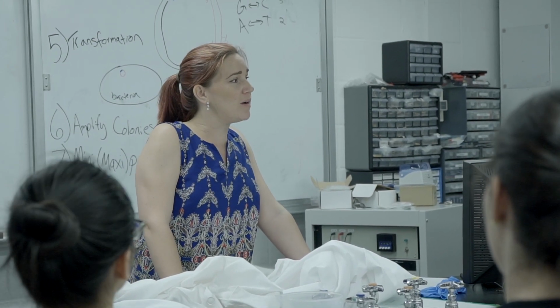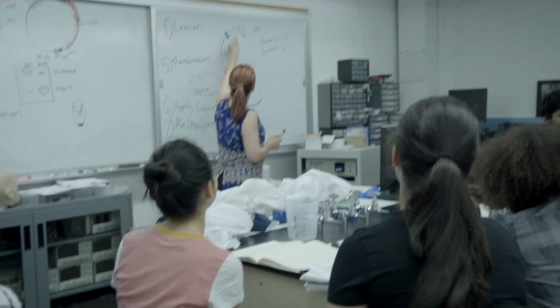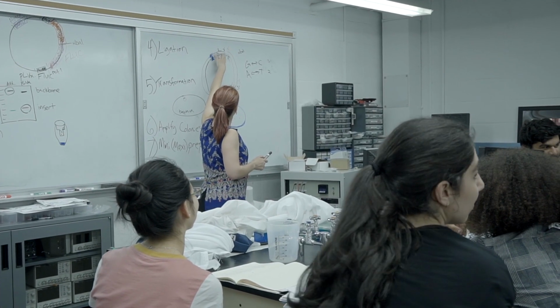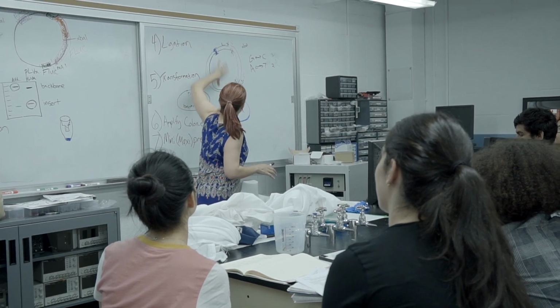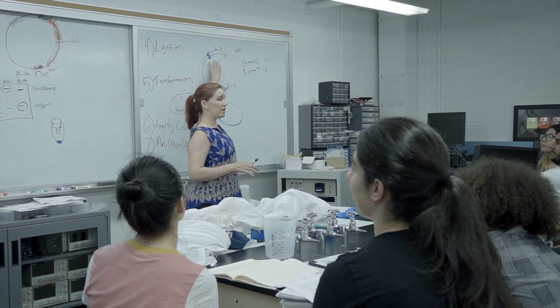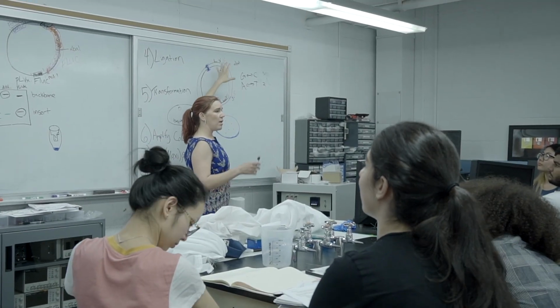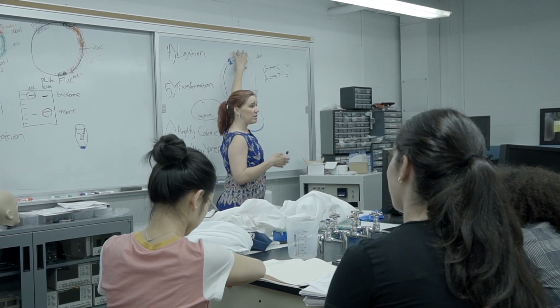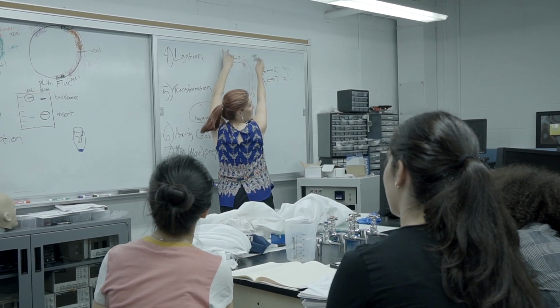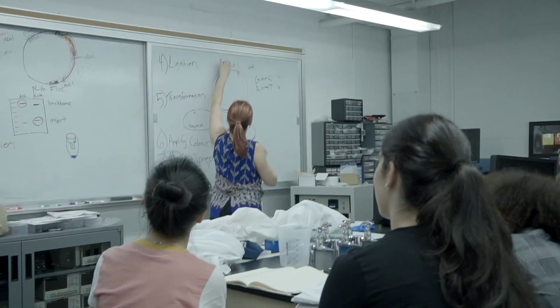Yes? How do the primers work? Oh, great question. In order for your reaction to know, because we are going to copy this whole thing for the PCR, right? In order for the polymerase to know where to start, because then we're going to build on our template, right? We're going to match. If there's an A there, we're going to put a T, and if there's a G there, we're going to put a C.